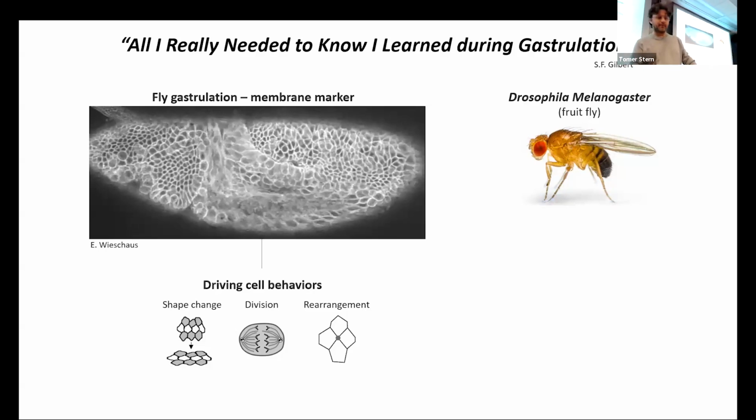And what's the time frame of that movie? Well, I would say about an hour-ish. It starts about 3 hours after egg laying, and it's about 1 hour long. My God, that's incredible. That's what a dramatic change in an hour. In 20 seconds a cell will stop overlapping with itself from the next time point. So I'm saying like 20 seconds will come here.